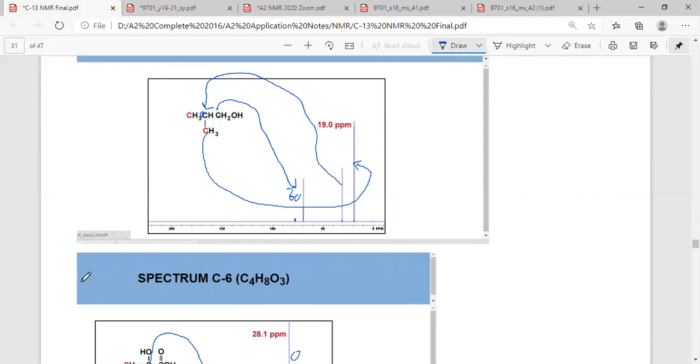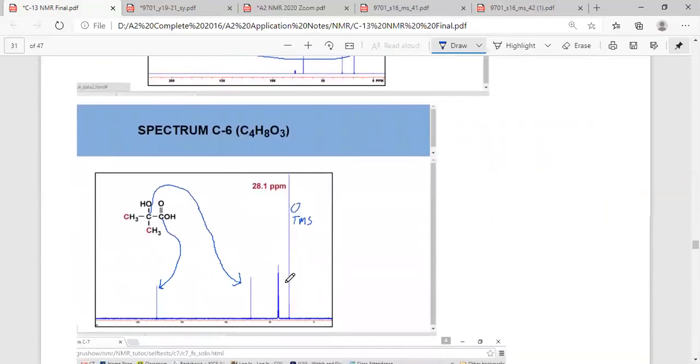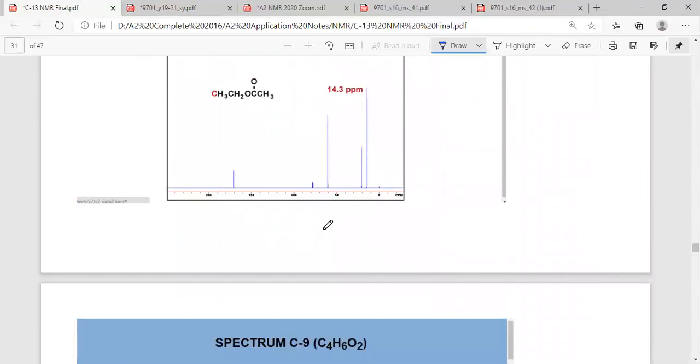Okay, all right. Now, again, you can see there are 2 OH groups here. This is your higher one, which is your carboxylic acid. Here, the alcohol is here. The last 2 CH3 are here. Okay, here. TMS. This is TMS. This is 0. Okay, this one, of course, guys. This one here is this one here. Okay, similarly here, all right.